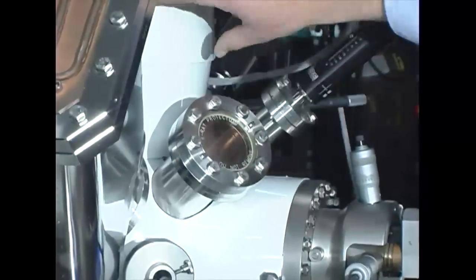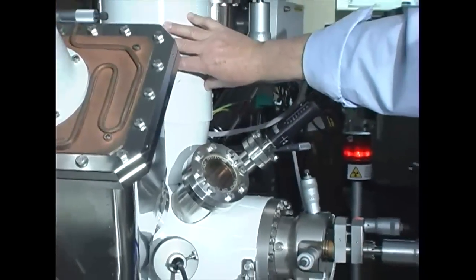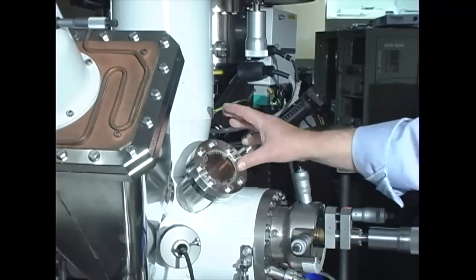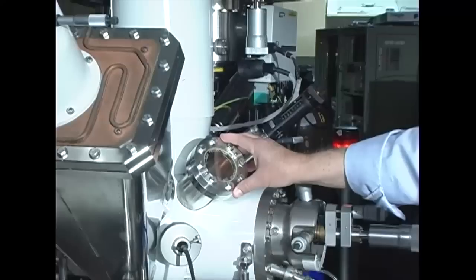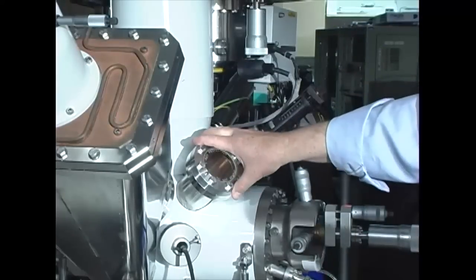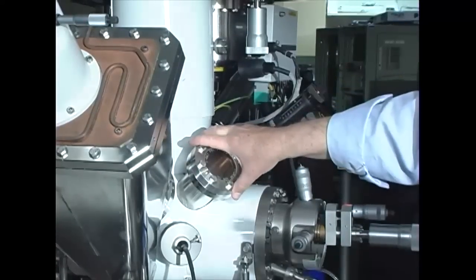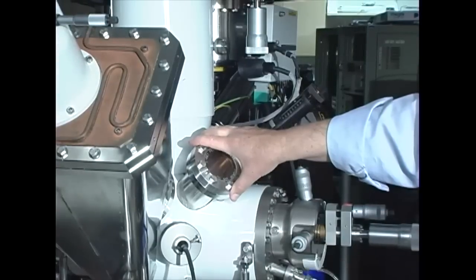in terms of our ability to do surface analysis. These photoelectrons that are collected have kinetic energies that are directly related to the element from which they were ejected. All right? And the conservation of energy equation says that the kinetic energy of the ejected photoelectrons is related to the source energy, the excitation source, whether it be these X-rays here or UV photons, the binding energy of those photoelectrons, and then finally the work function of the spectrometer.